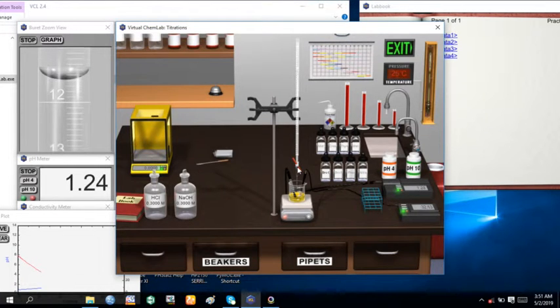Drop one after the other. Watch the experiment. It is running. Keep on watching. Then you can stop slowly and let it run drop by drop.